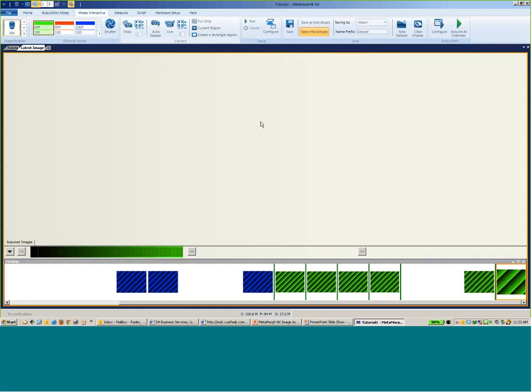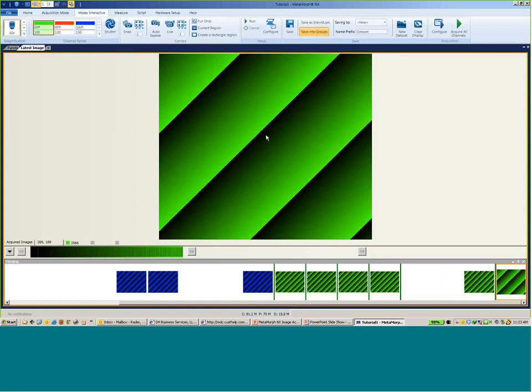And then the channel settings, this is where I would come in and set up my exposure time and gain settings, because I've set the camera settings to be per channel for the gain. My illumination settings, I can configure my auto expose. When I do auto expose, this is where you set up the target intensity, which is what it acquires.